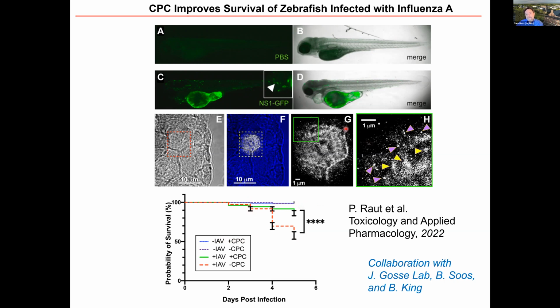And we are able to visualize HA clusters inside of those zebrafish because they're optically clear and the Casper mutant is fairly low background. So this offers an opportunity to do in vivo infection in an animal model, visualize the viral structures with super resolution, and do drug testing. And these zebrafish are able to reproduce and be genetically modified on a fairly short time scale so that we can do fairly high throughput testing. So that was also part of this toxicology and applied pharmacology paper.